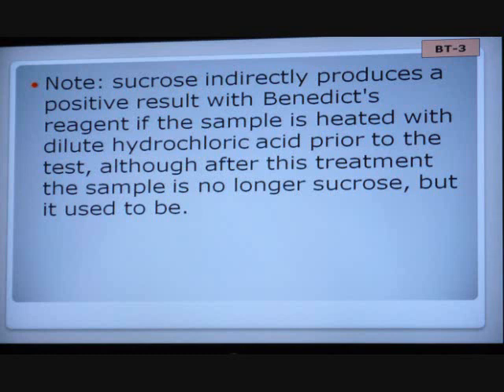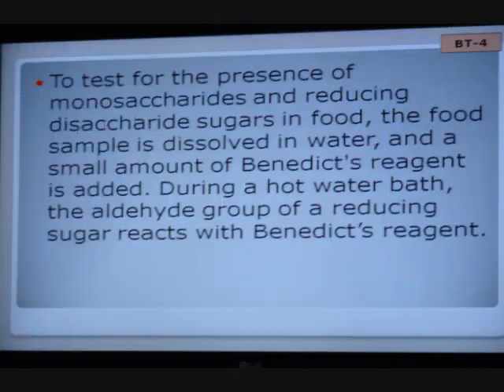Now, next slide. We're going to add water to it because you've got to have water to do the test. And then you put in the Benedict solution. Stir it up a little bit. And then you put it in the hot water bath. That's why I said, be sure to indicate on your test tube it's yours and which one of yours it was. So when we get done, we're going to know what happened.